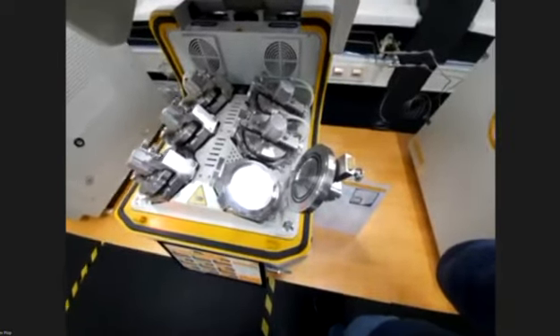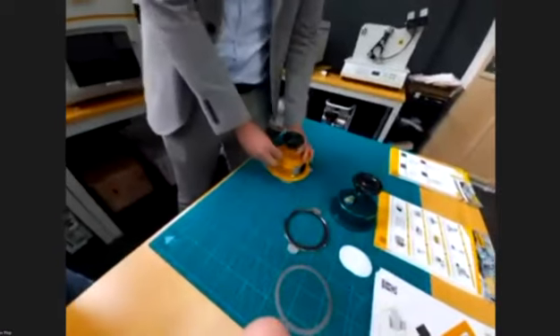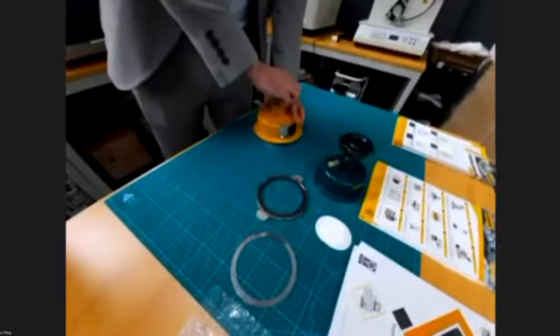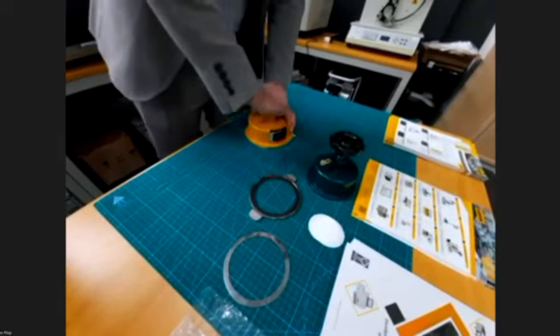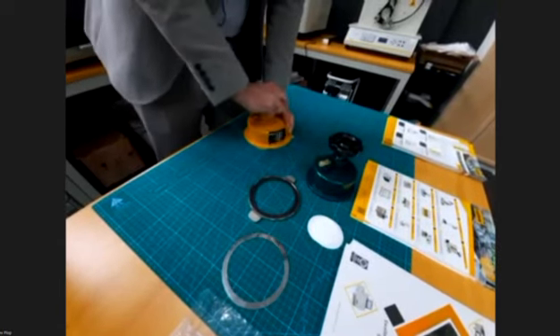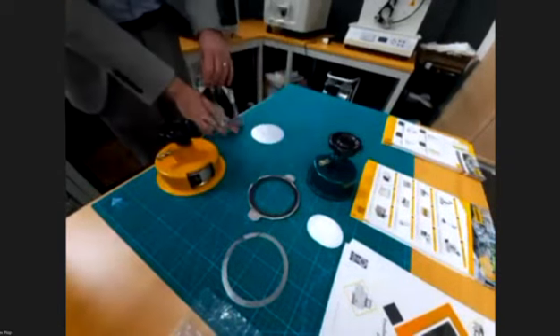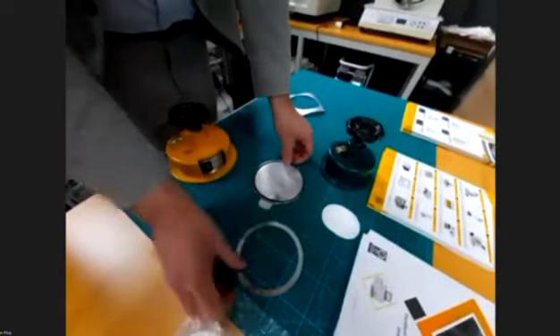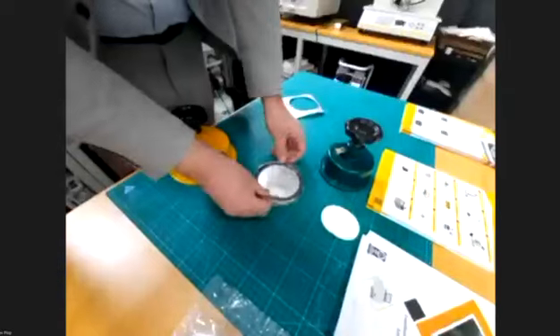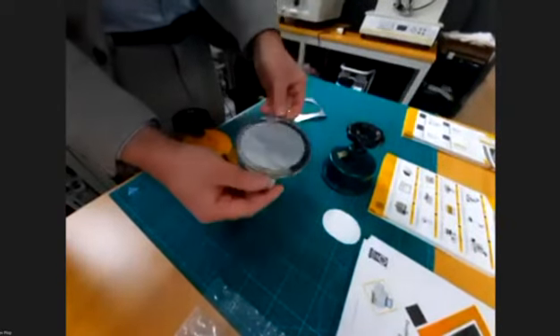So for this, we have our film here. We have the Labthink cutter. We set our cutter onto the film. So we're just preparing our sample. As you can see, it's already prepared. We will come to the fixing rings, and our sample is already done, already prepared.